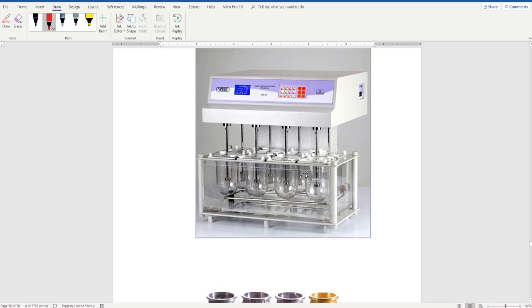It has to be within plus minus 1% of the volume specified in the pharmacopoeia. That means if the pharmacopoeia says 900 ml, it has to be plus minus 1% of the 900 ml. Because you know that the volume will affect also dissolution. The more I add, the faster the tablets will dissolve.